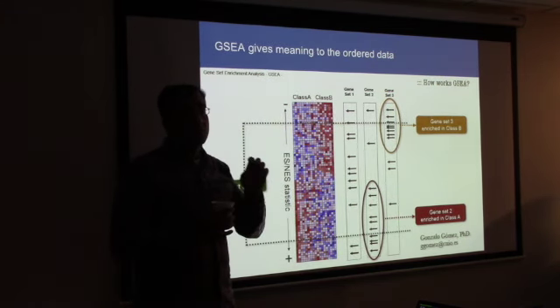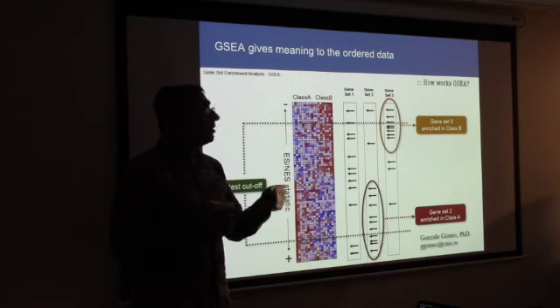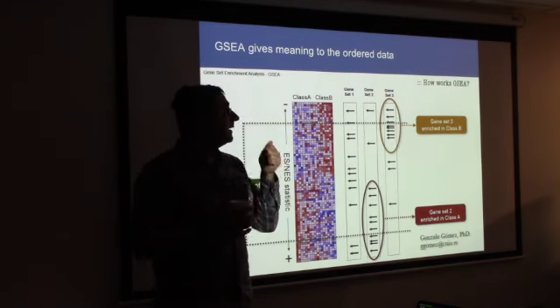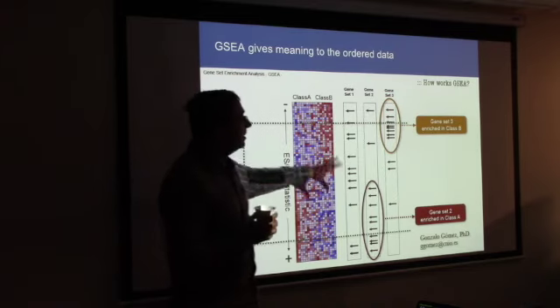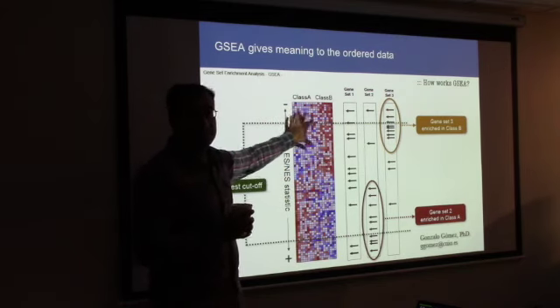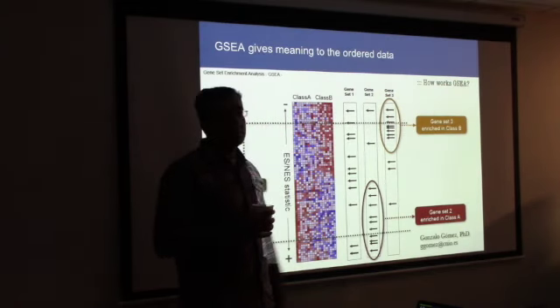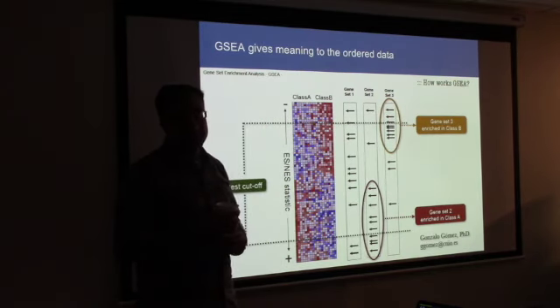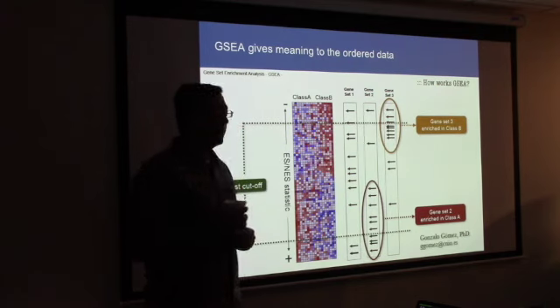And you want to put a number on it. What is the enrichment score? First of all, are they enriched? If so, are they enriched enough compared to a random set of genes? So if I were to just take a random permutation of genes and then score them in this particular case, how does that random permutation compare to my gene set, which is non-random, because this is a gene set enriched in pancreatic cancer? That comparison is what you're interested in as well, all right?